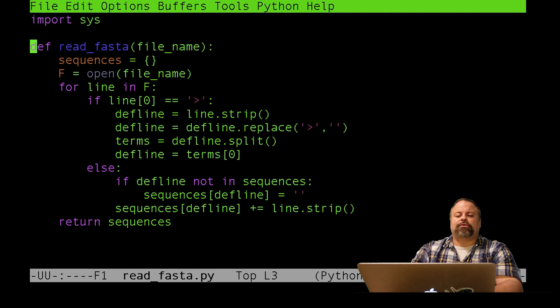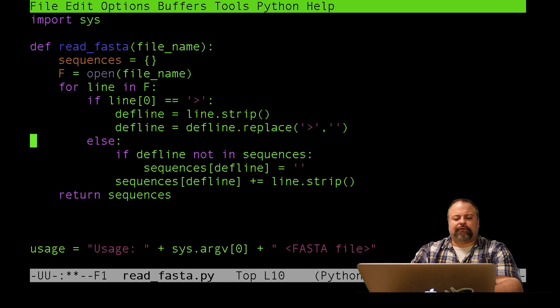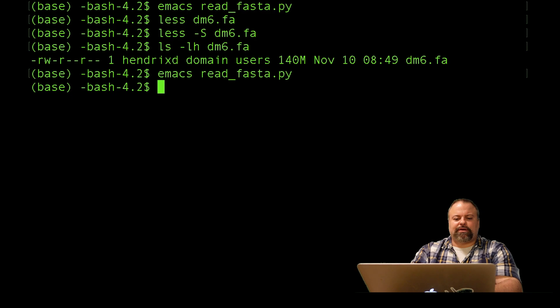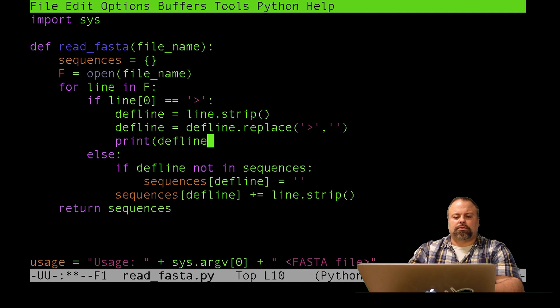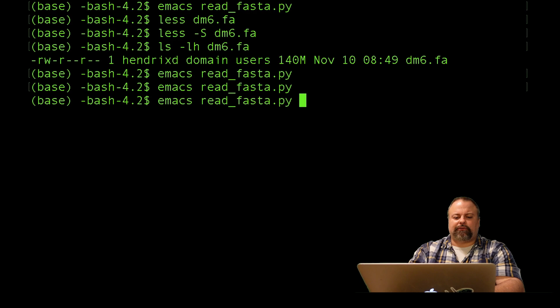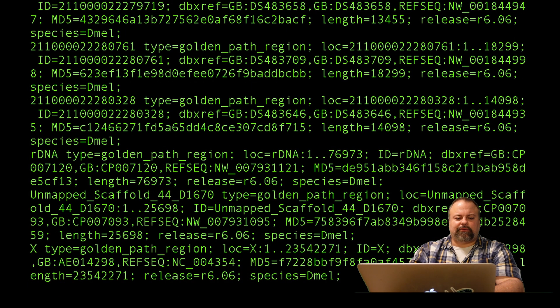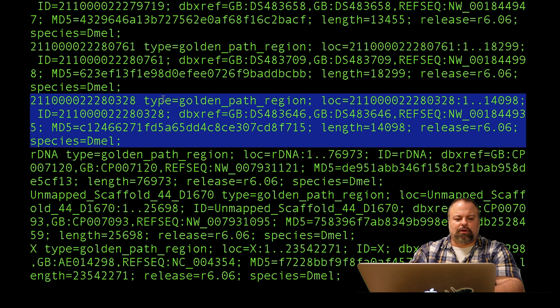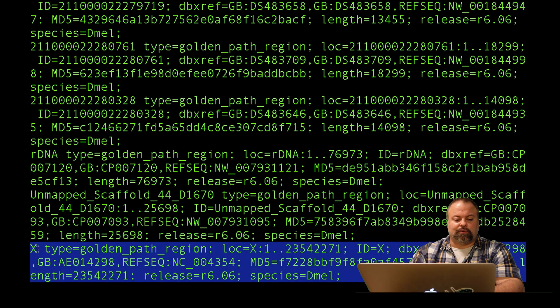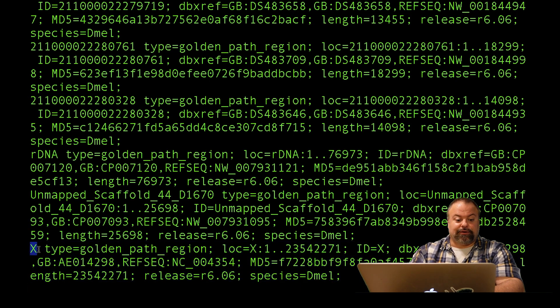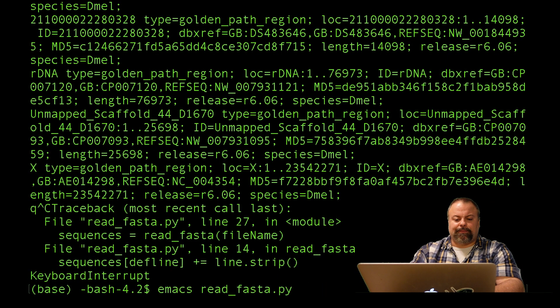The approach I want to use is join. But first, if I try to print out the deflines as I go and run this — Python read FASTA DM6 — I get these huge deflines. The deflines are actually quite long. Really, the unique identifier is just the first part. But it gets stuck on chromosome X and just hangs there because it's concatenating. So I'm going to press Control-C to interrupt that and go back.